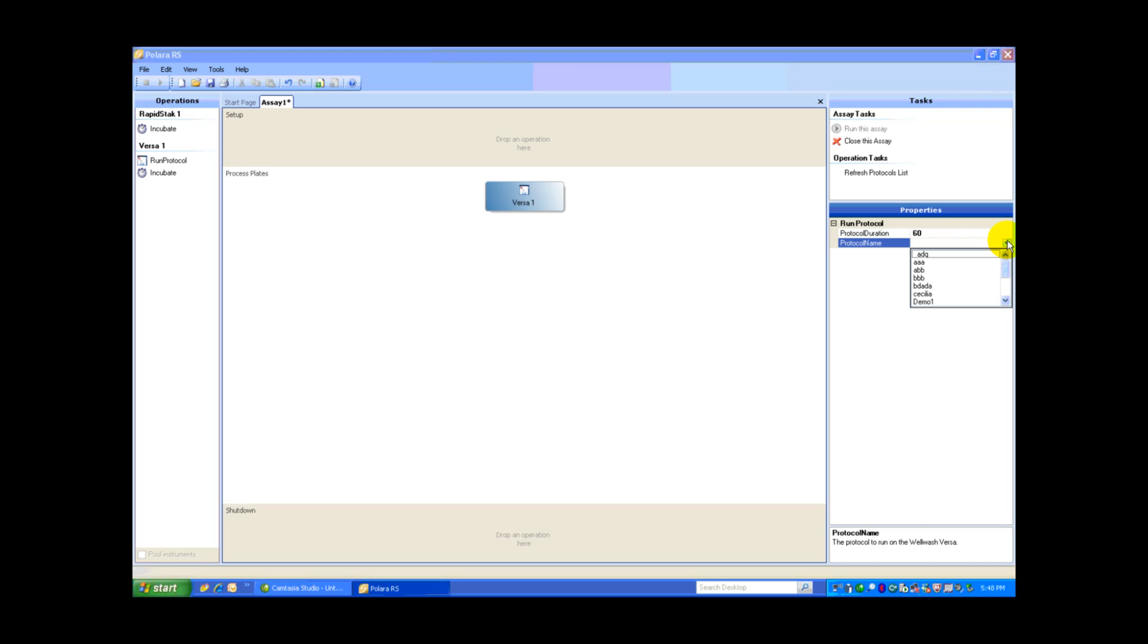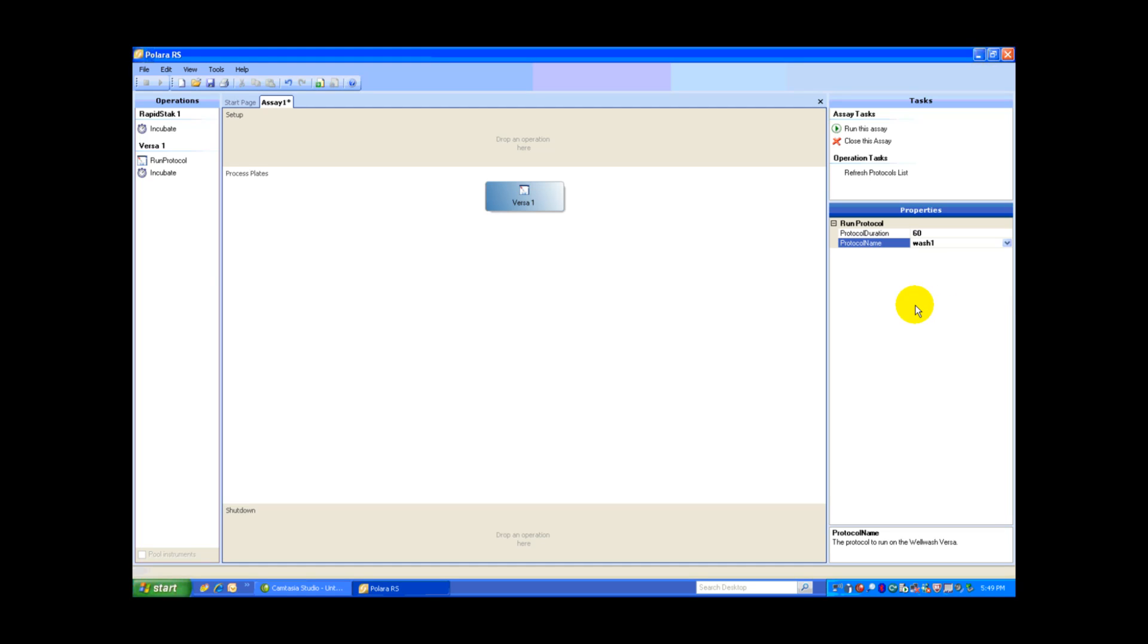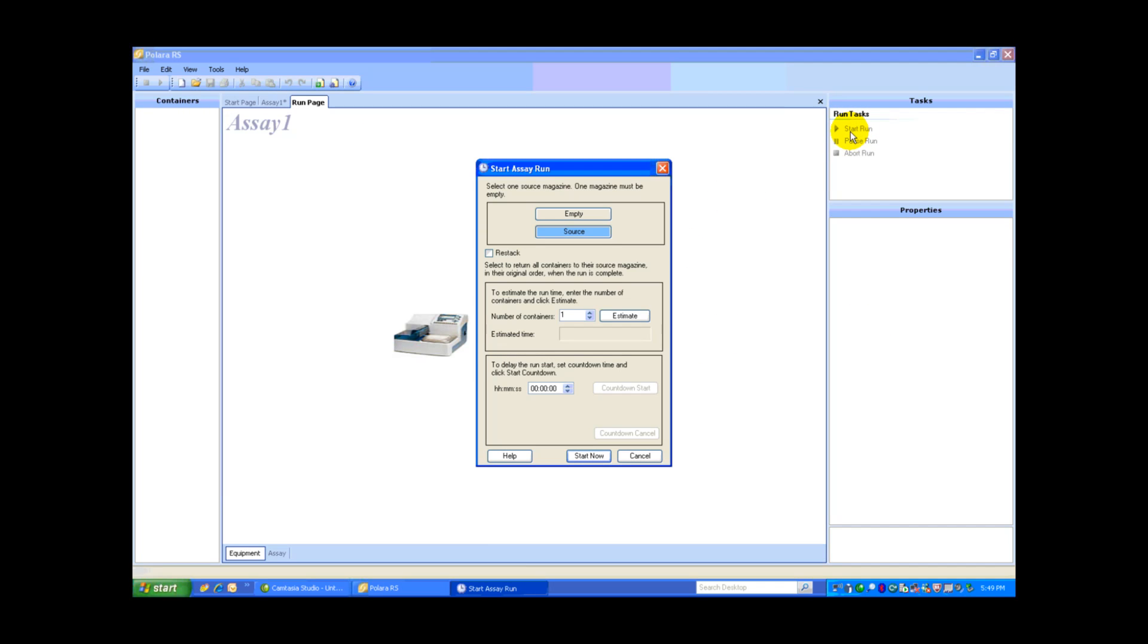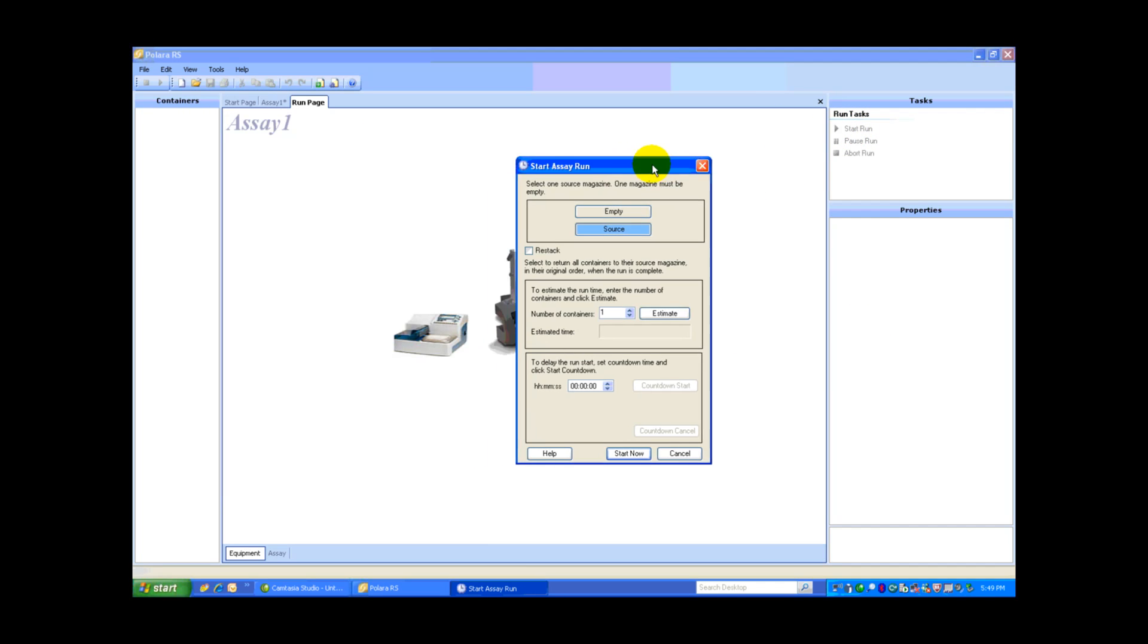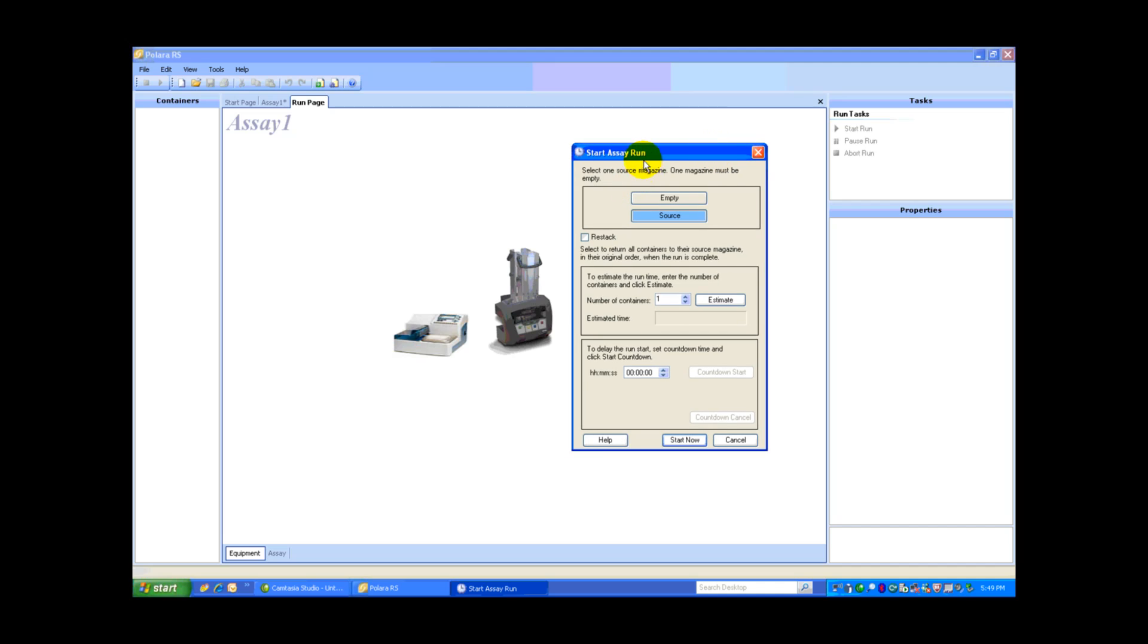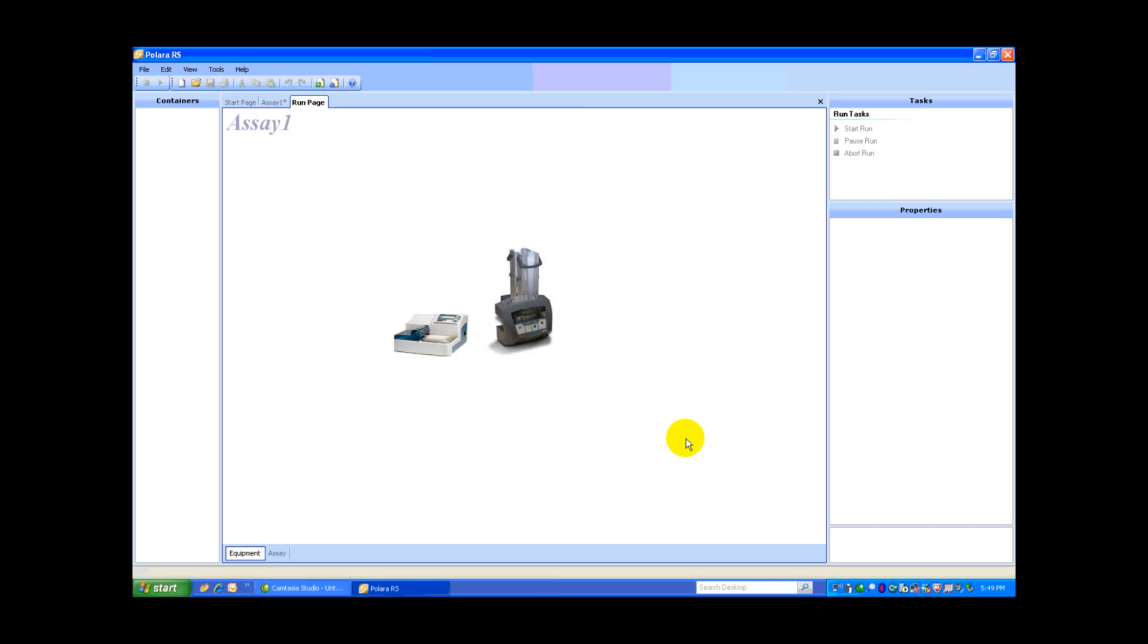Back to Properties, and there we are. All the protocols saved on this specific Versa. I'm going to select Wash 1. All I have to do now is select Run this assay. Our start assay is set up. We have source plates in the front and we have an empty stack in the rear. I'm going to select Restack at the end and start now.